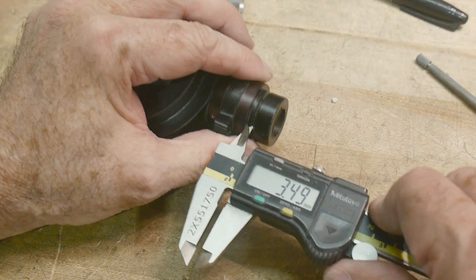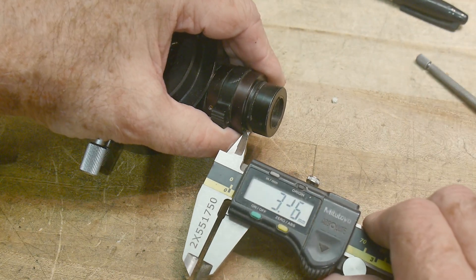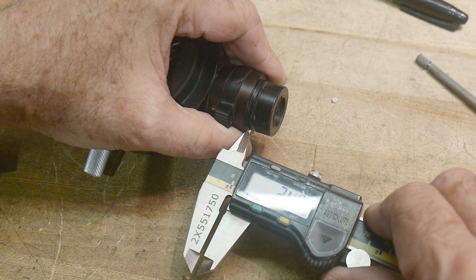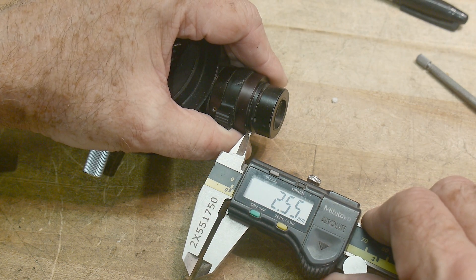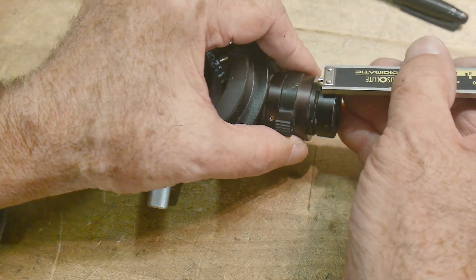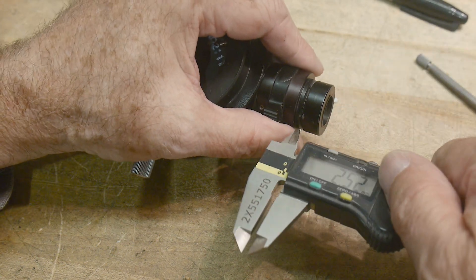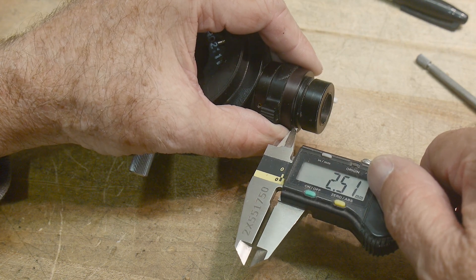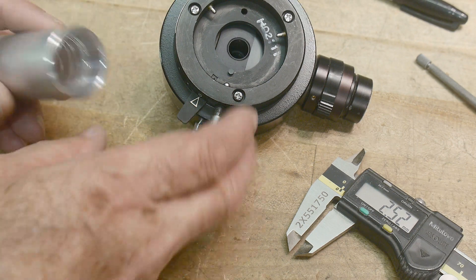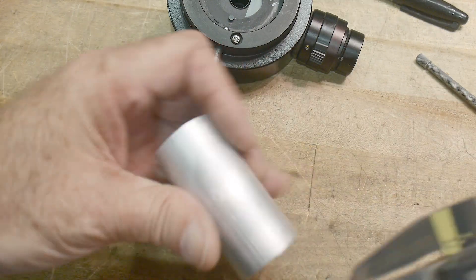Let's see if I can estimate where the center of the groove is here — lighting's not great. That center's right about there. 2.6... what is 2.5? I figured they put it on an even mark — they're Japanese, they're probably gonna put it on an even mark. I think 2.5 is probably pretty good. So I'll go ahead and transfer that onto here.